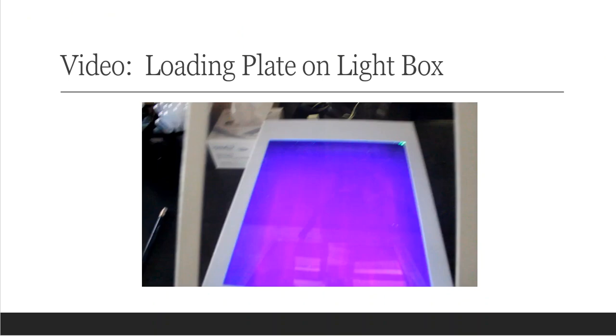All right, so here's the operation of the light box and me putting a plate onto that light box so you can see how that process works.